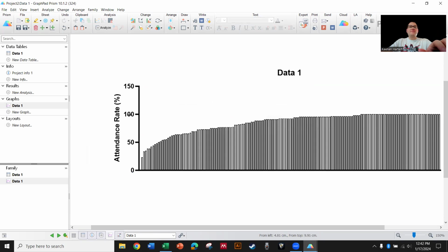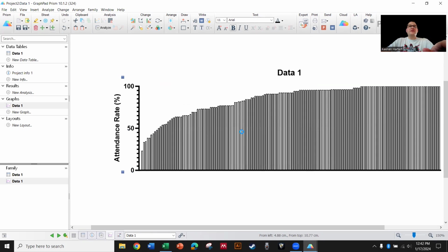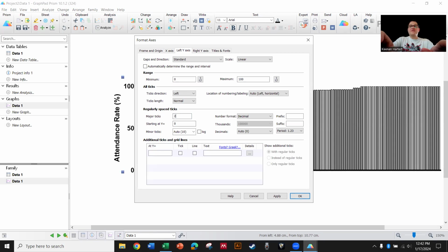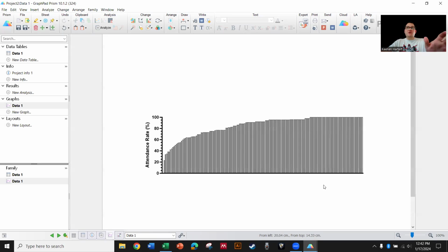Okay. Again, I can probably go in here. I'm going to make this perfect. And actually, no, I'm all meticulous now. I'm going all crazy. I want my little ticks. Done. Okay. Now we're all set. Don't need a title either. All right. Nice. Looks pretty good, right?